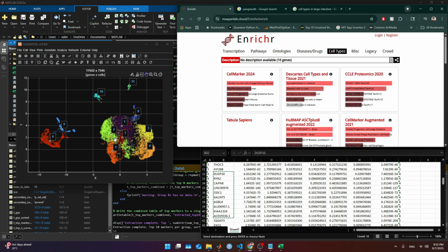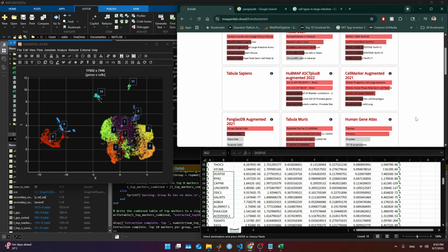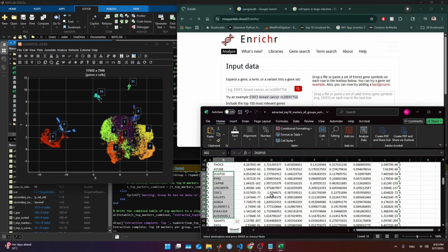The problem is that find markers compares the cluster, for example, one against the rest. So it already loses resolution if we are not packing all this big island together. That's why we are getting some mixtures of genes of different signatures. For example, this is myofibroblast. I don't know if that is valid here. Very likely not. But it's possible that this goblet cell progenitor in large intestine, those are part of the colonocytes. That cluster number 4 potentially is goblet cells. And so far, so good.